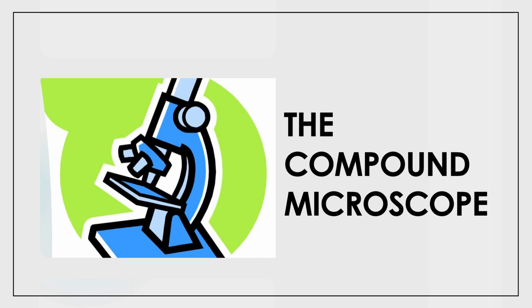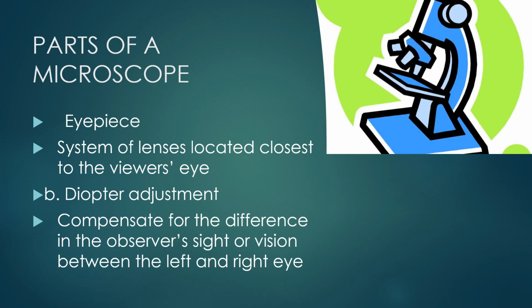Good day. Okay, so today we're going to take a look at your compound microscope. Yes, your compound microscope. This will be our companion until the end of general histology laboratory. Okay, and so with that, let's take a look, of course. And so this one will magnify the organisms or materials that cannot be seen by the naked eye. Okay, and so let's take a look at the parts of your microscope.